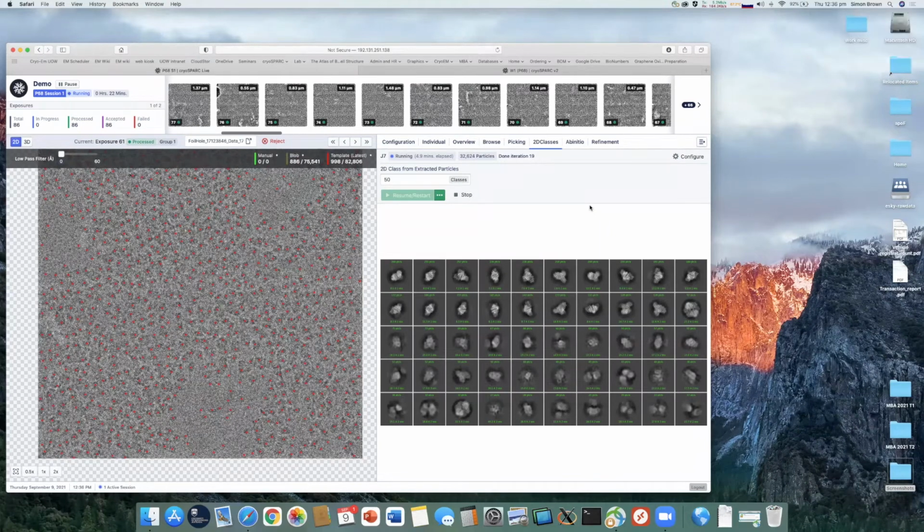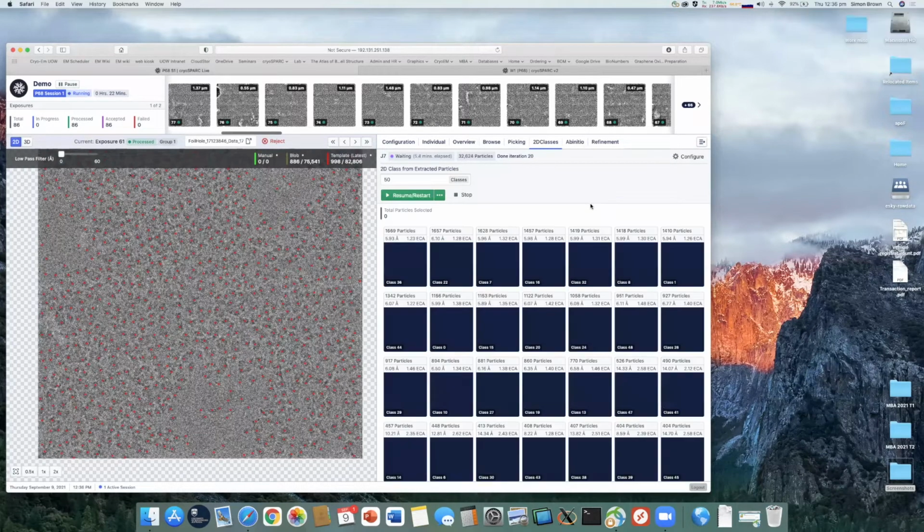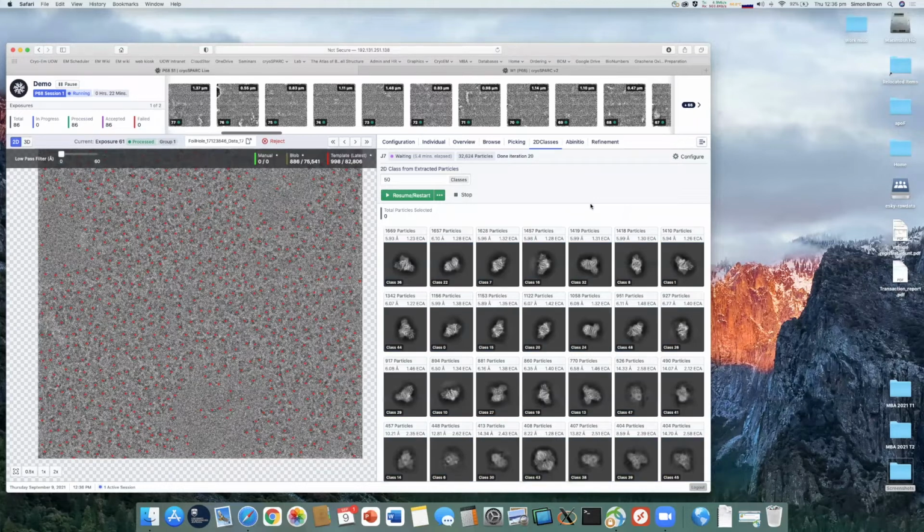So Simon, if I'm understanding you correctly, based on a summary of our conversation when we built this, it's more important to design as fast as possible local storage to feed cryoSPARC than necessarily having more GPUs in that system once you've got a minimum number.